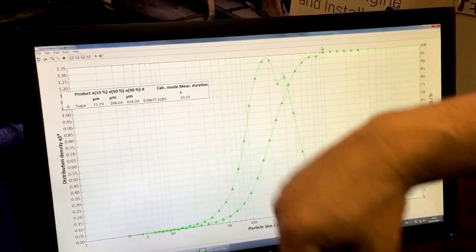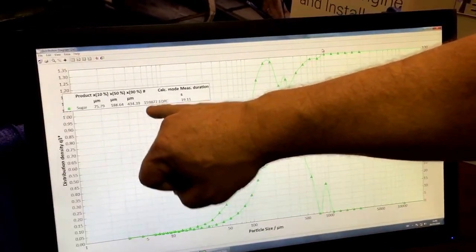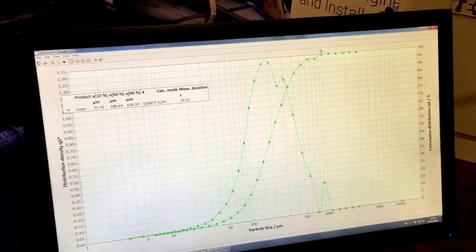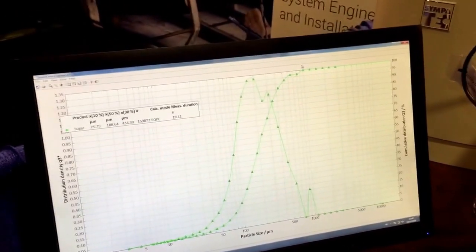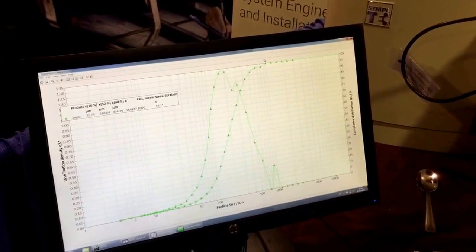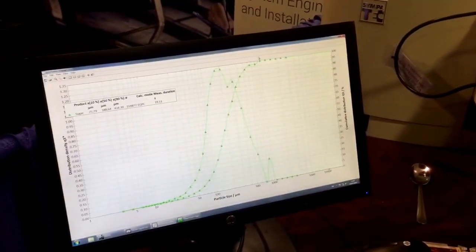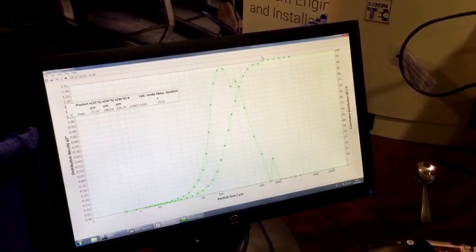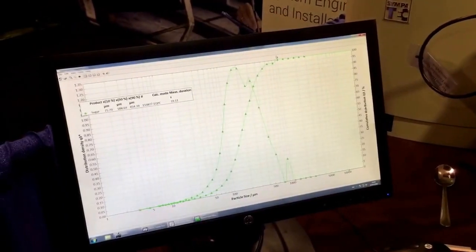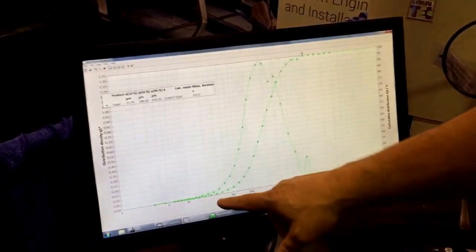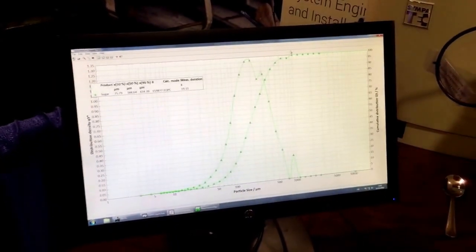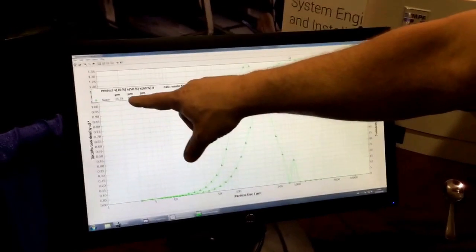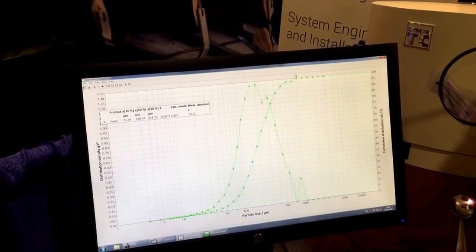In this case, the measurement lasted for about 19 seconds. I measured 160,000 particles. Wow, 160,000 particles in that sugar packet. There's a lot of fines, a lot of fines, but there are some big guys too. This gives me my particle size distribution and I see that my median is around 188 microns.